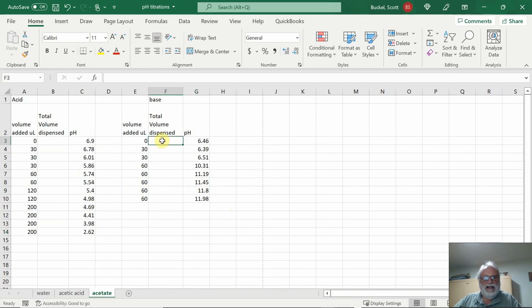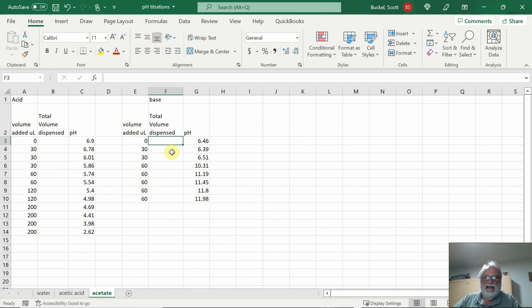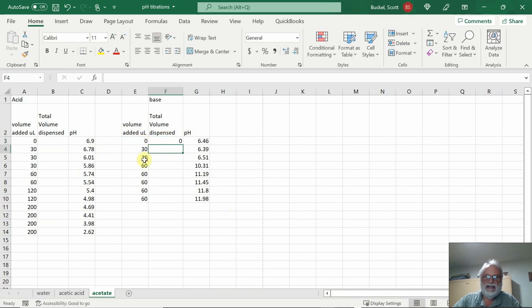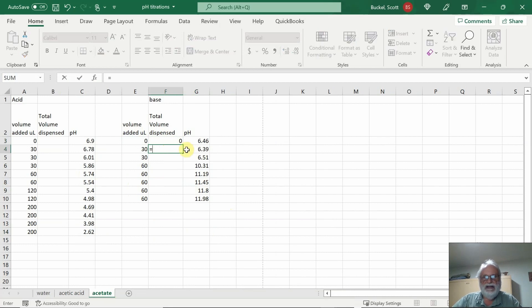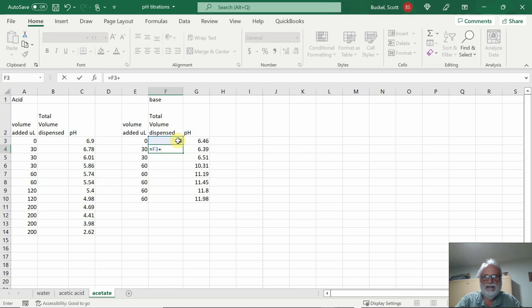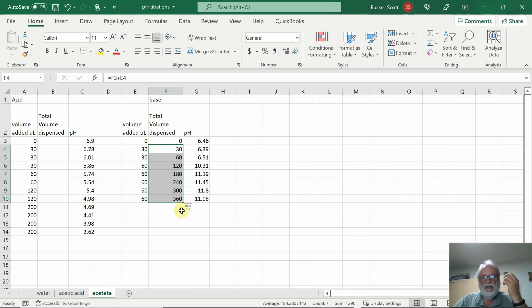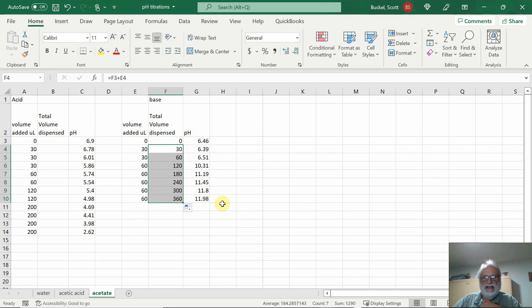I'm going to start with the base data here. The column in the tables you had in the experiment was you recorded the amount of volume you added, and then you had to calculate the total volume you added. Doing that in Excel can be very easy. I put in the equal sign, just click there, and that's equal, so that zero comes here. Then I put equal here and click on the cell above, hit shift, and then make the plus, and hit that one, and that adds them together. From here down, I can just drag that down, and I have the total volume.